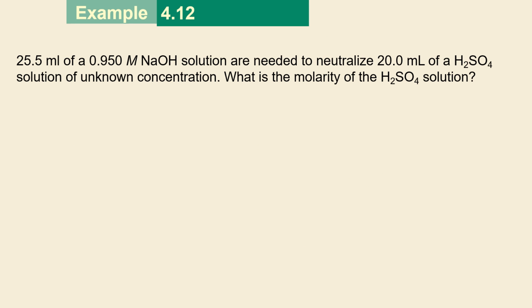One more problem to tackle. We just basically standardized NaOH. So now let's say we want to take that standardized NaOH and use it to determine the concentration of an acid of unknown concentration. So now let's pretend this is standardized.